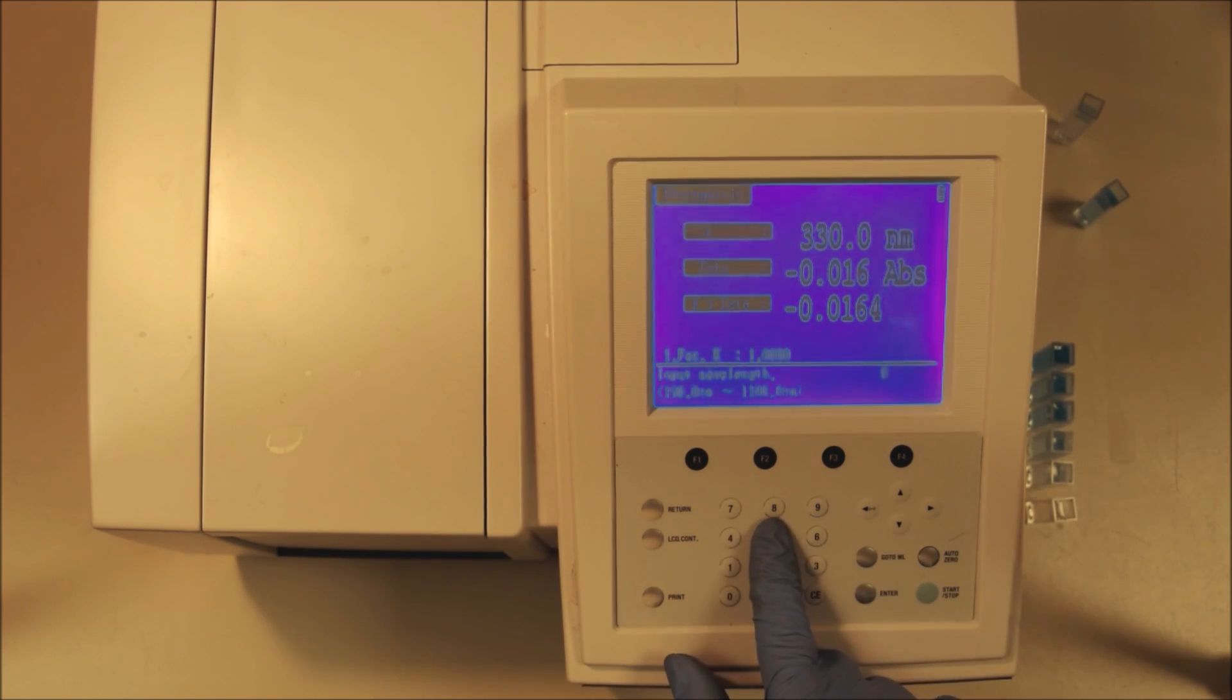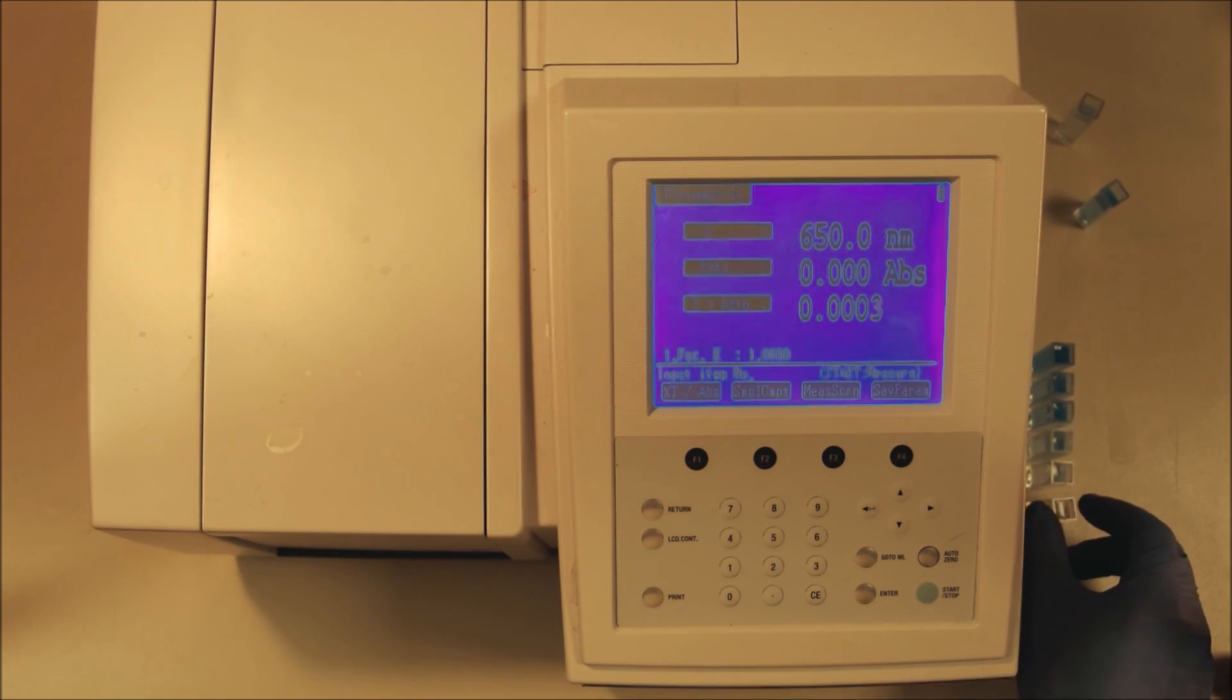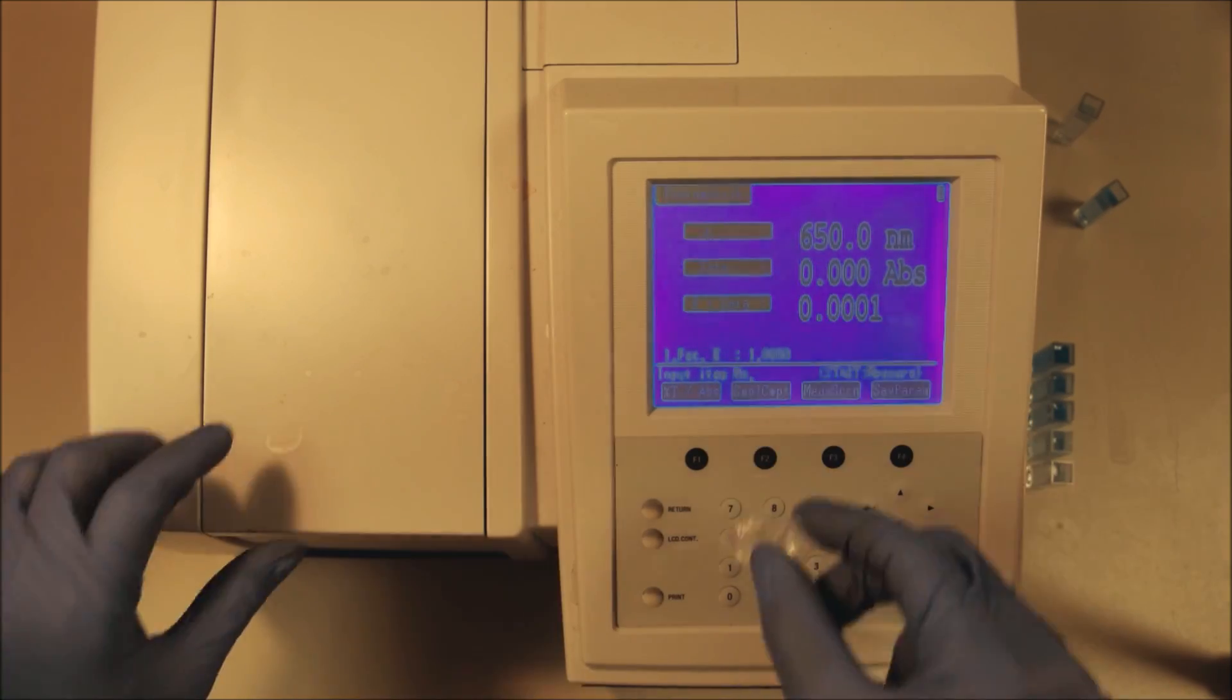Then what we need to do is choose the wavelength that we want to measure at. 650 nanometers, so we put that in by saying go to wavelength 650 enter. We'll come back to why we're going to use 650 nanometers later. In the meantime let's get on with setting up the machine.